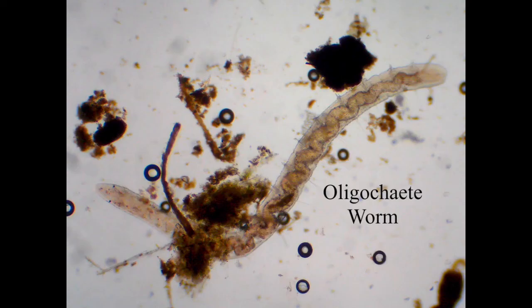Here's a typical oligochaete worm, which is just a fancy way of saying a true worm. You can see the segments very clearly, with bristles at the edges that it uses to push itself along — think of our earthworms; this is very closely related but a typical aquatic one. You can see the eyes at the front, and you can very clearly make out the gut or intestine running all the way down the length of the body. This shouldn't be confused with nematode worms, which are something different again.